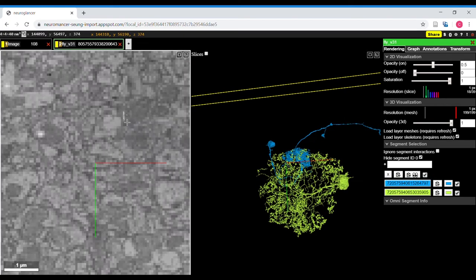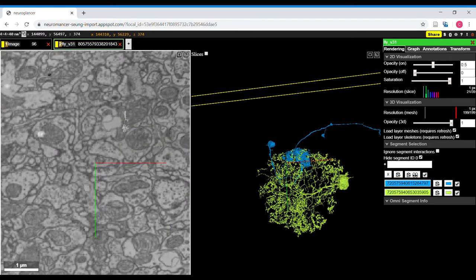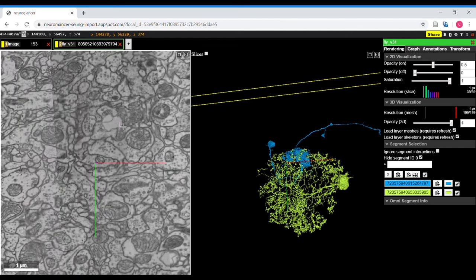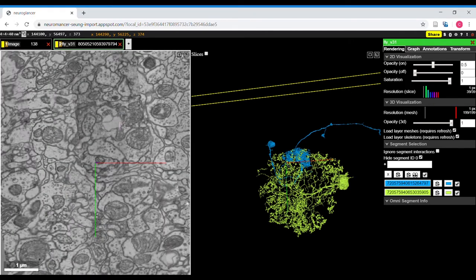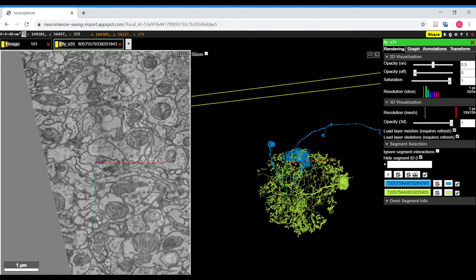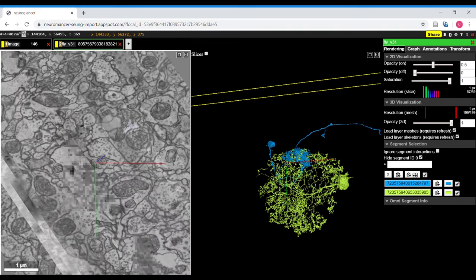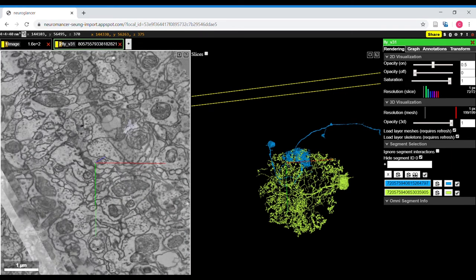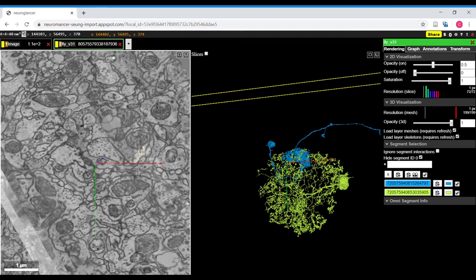But shift drag shouldn't be done in the 2D view because it spins the whole brain stack around and creates strange artifacts. So what you want to do is shift drag back until the red axis is pointing to the right.